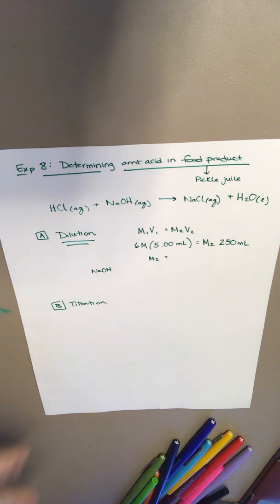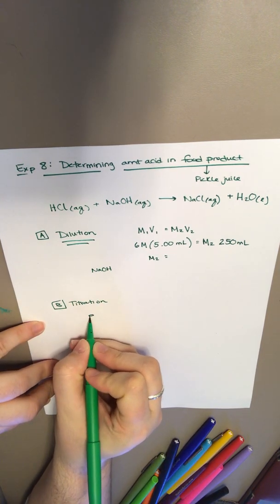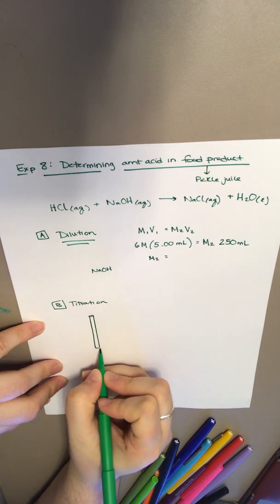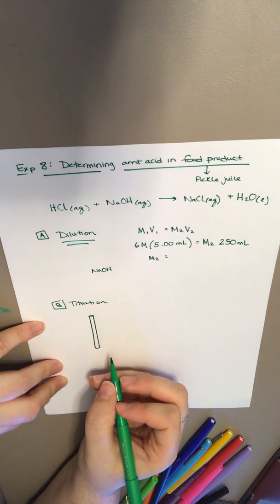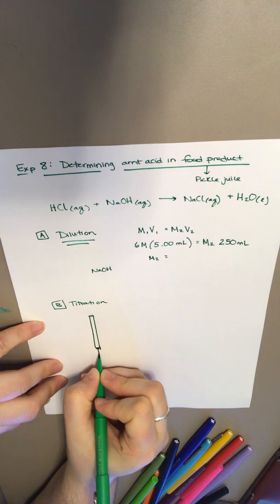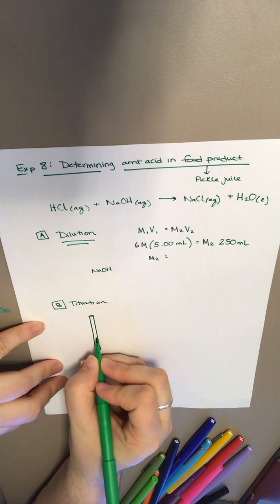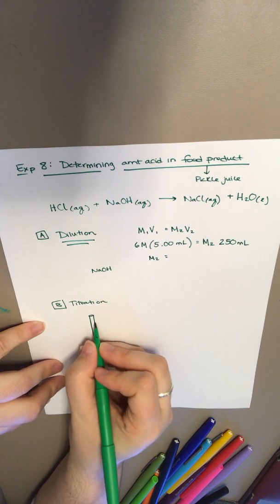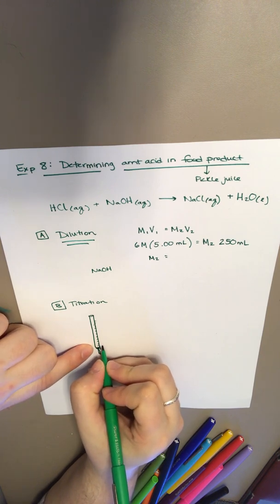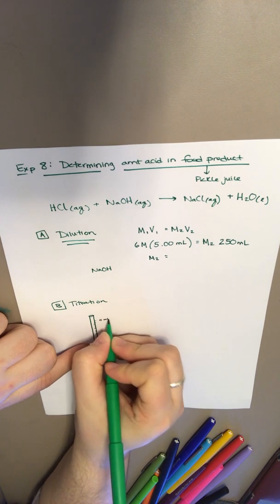For the titration itself, I'm just going to quickly explain what we're going to be doing. In this lab, we would have been using something called a burette. A burette looks like a large graduated cylinder, but it has a little spout at the end. You would notice all of these markings, with the most amount, say 100 milliliters, and we would start with 0 at the top.